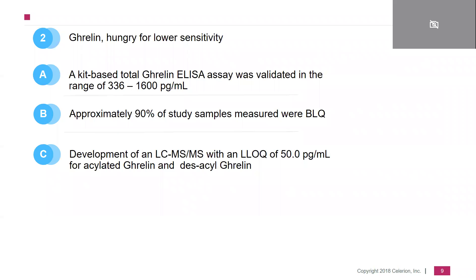The second example today, again in the metabolic disease area, is ghrelin — hungry for lower sensitivity. The assay development had started off with a classical ELISA measuring in the range of 300 to 1600 pg/mL, but what we found out is that approximately 90% of all study samples measured below the quantitation range. So we had to come up with another solution: the transition from an ELISA method to an LC-MS method, with an LLOQ of roughly 50 pg/mL.